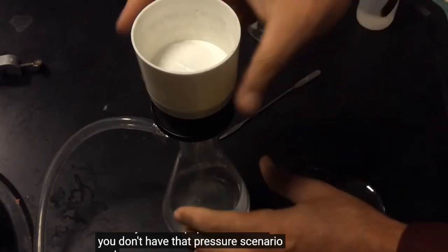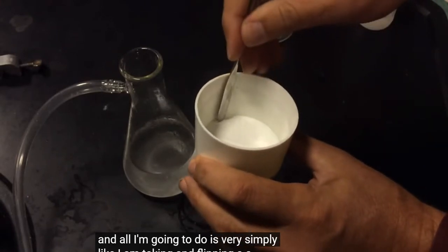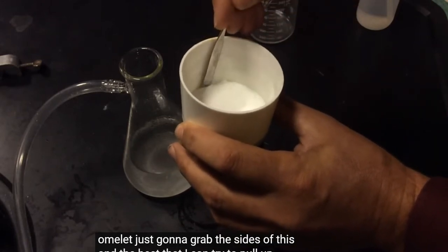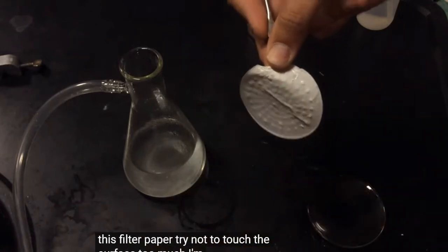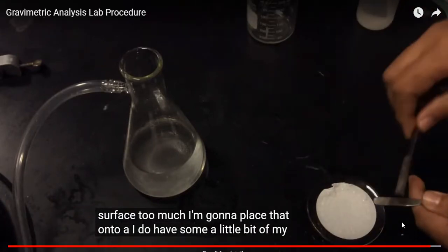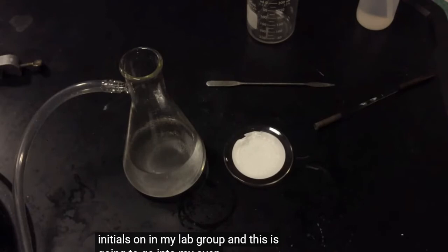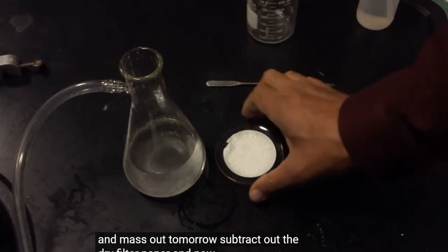And all I'm going to do is very simply, like I'm flipping an omelet, grab the sides of this the best that I can. I'm going to pull up this filter paper, trying not to touch the surface too much. I do have a little bit of my data on here, so I'm trying to scrape that off. I'm going to put this on a watch glass that I should also have my initials and lab group on, and this is going to go into my oven. We're going to come back tomorrow and mass it out, subtract out the dry filter paper, and now we can get the mass of our precipitate.